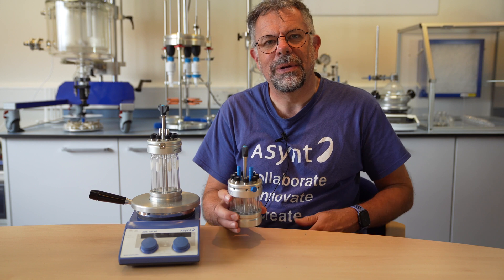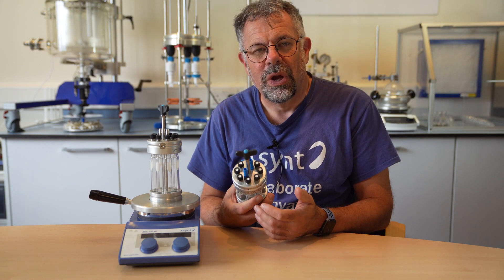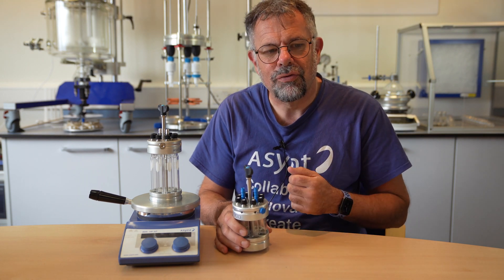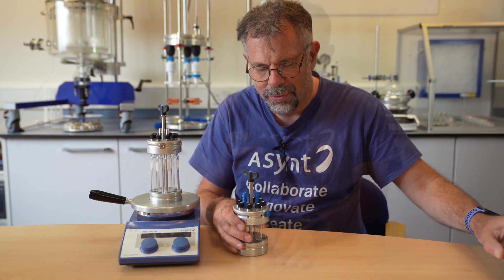The Octo has been an extremely successful parallel reactor for us — no issues with its use — but there were things that were niggling me with the design, and that is with the gas addition, the ability to control gases. Let me show you a close-up on this Mark I Octo.